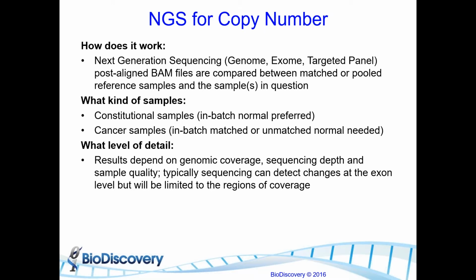Our sequence depth is also going to impact how well we are able to have our results, and that's going to be reflected also in our sample quality. Typically, the deeper that we go, the better our results are going to be, as we're going to have more capture and more to work with.